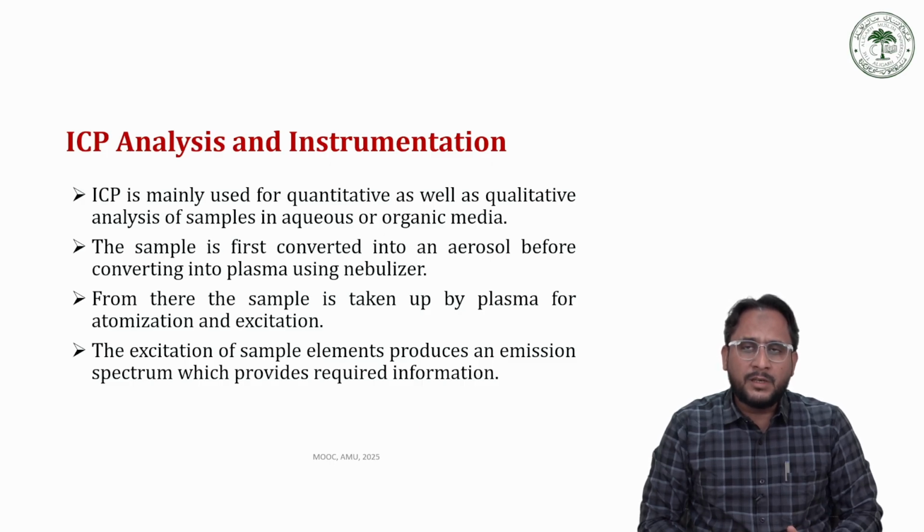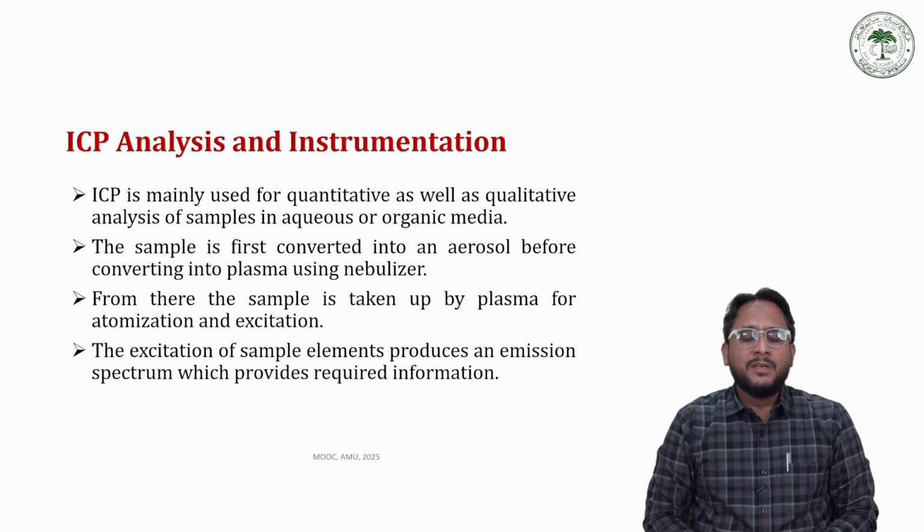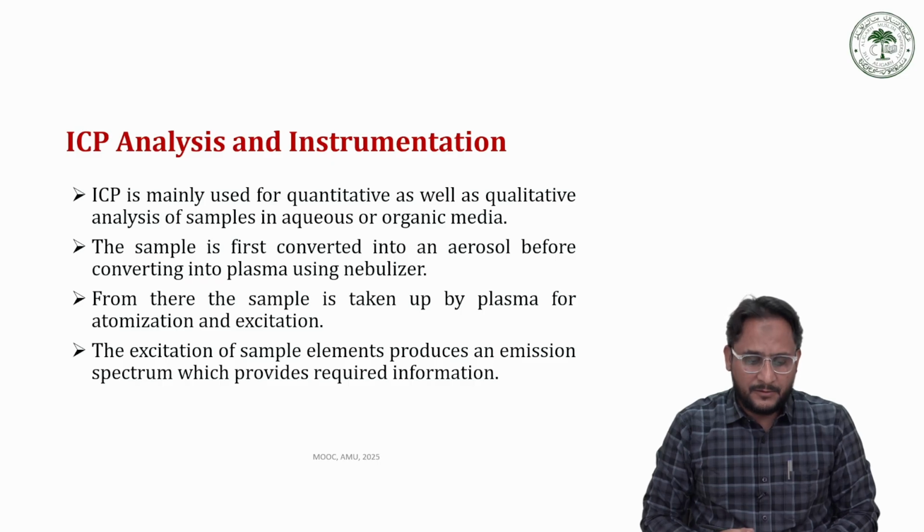So for simultaneous analysis of multiple elements, we always use charge coupled devices, which are present in solid state array detectors, SSA detectors.